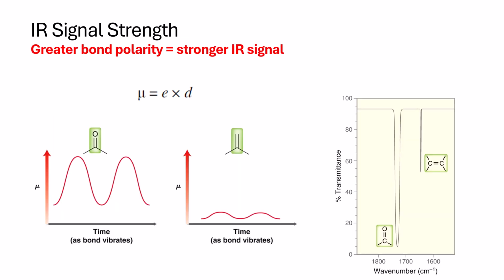Now, one important thing to distinguish in the same region: ketones and aldehydes, so carbonyl groups, are at about 1700, and a little bit under we have the carbon-carbon double bond that we see here. But notice this band is not as intense, so the carbonyl is much more intense. This is related to the oscillation of the dipole moment. Remember that this bond is polarized, so electrons are moved towards the oxygen.